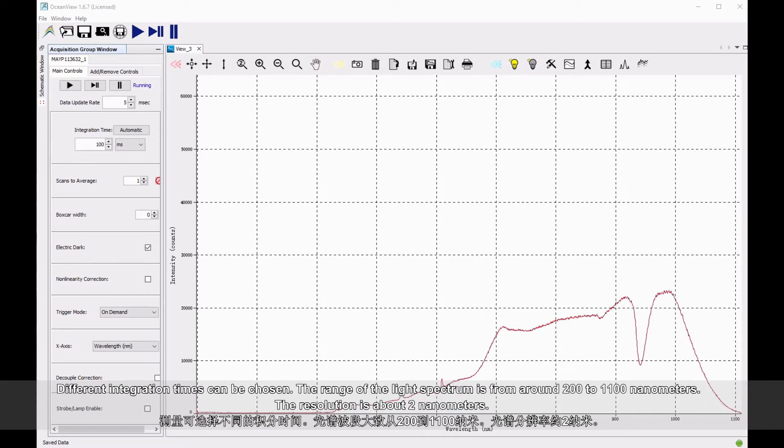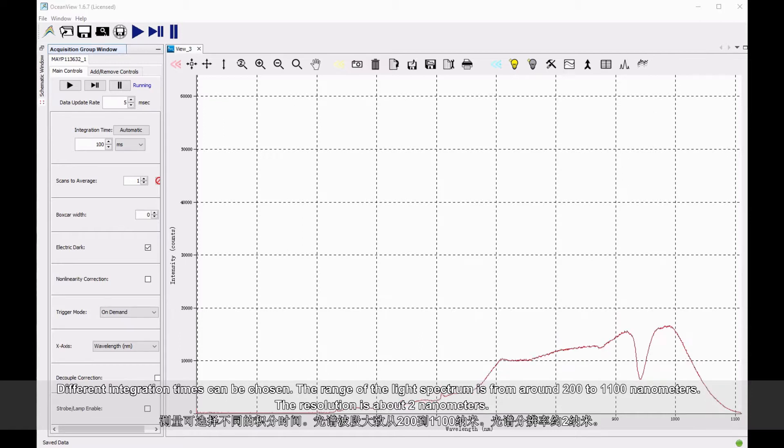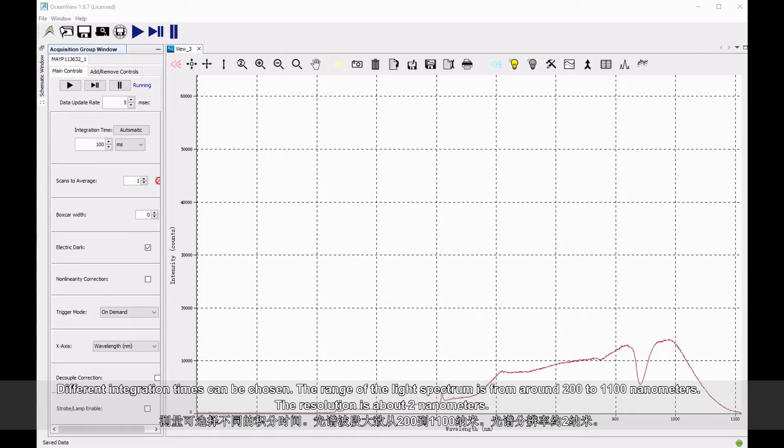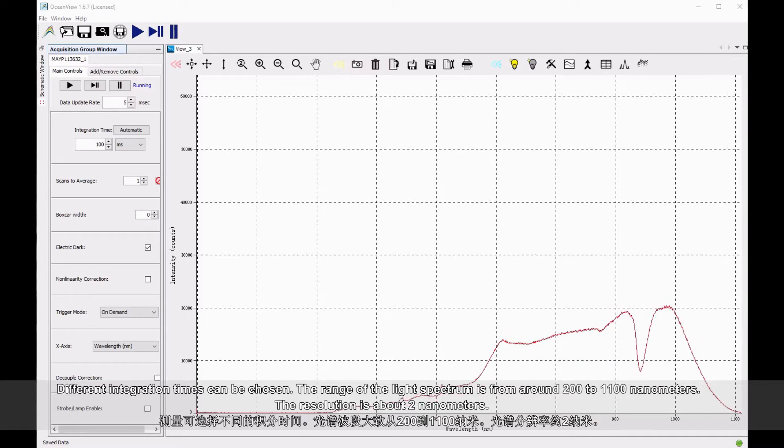Different integration times can be chosen. The range of the light spectrum is from around 200 to 1,100 nanometers. The resolution is about 2 nanometers.